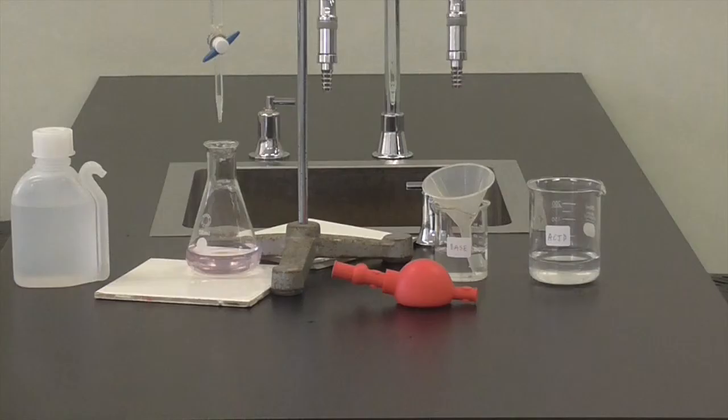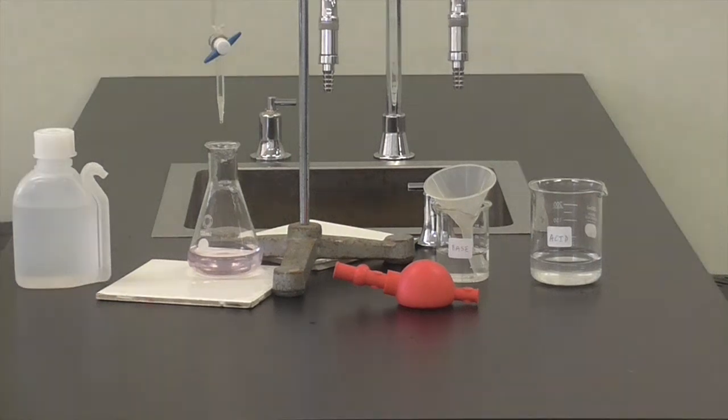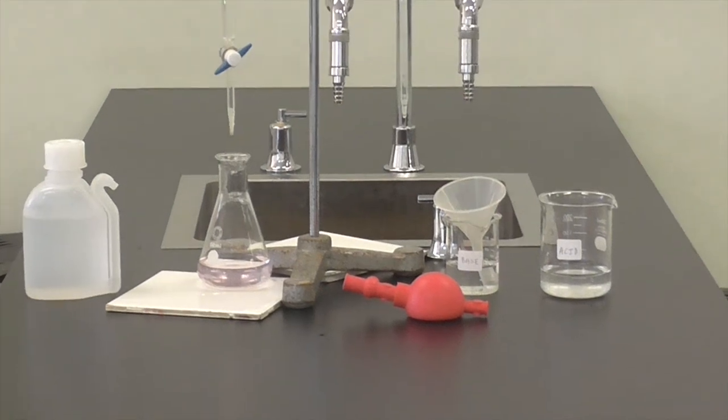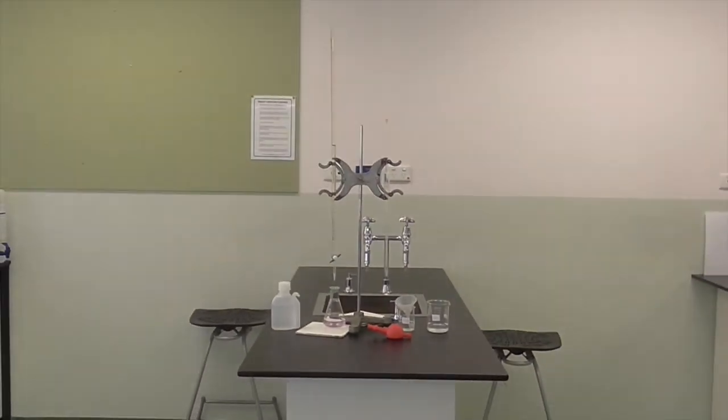This is the equipment we're going to use to do our titration. Our beakers of acid and base, a funnel, a pipette filler, conical flask, white tile, distilled water, a burette and a pipette in a stand.